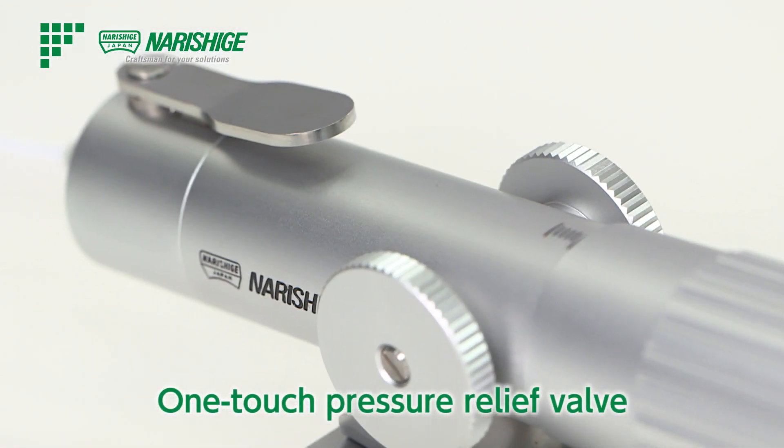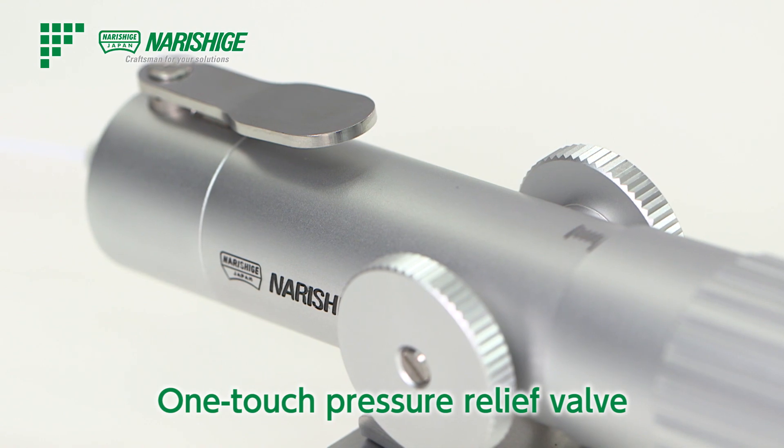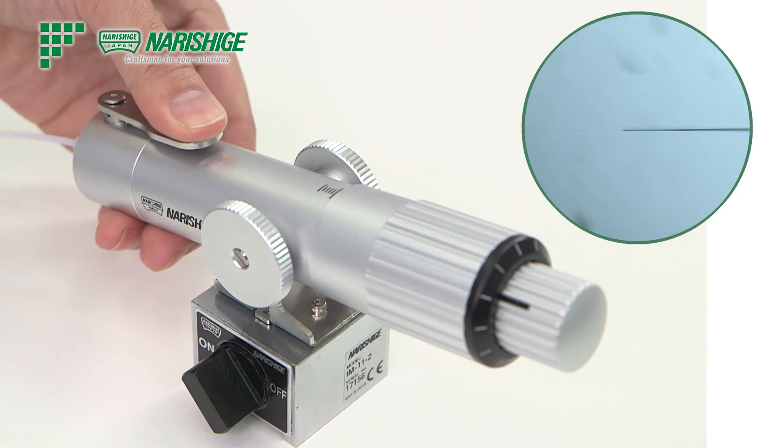The IM-11-2 comes equipped with the one-touch pressure relief valve, and pressure release can be done with a simple push.